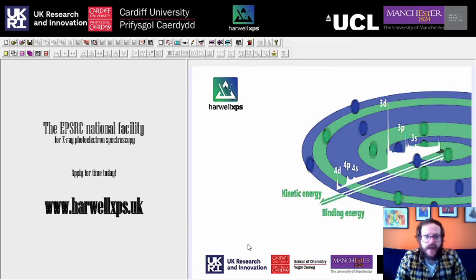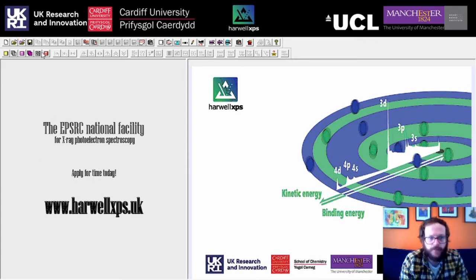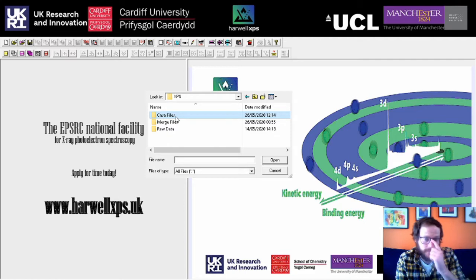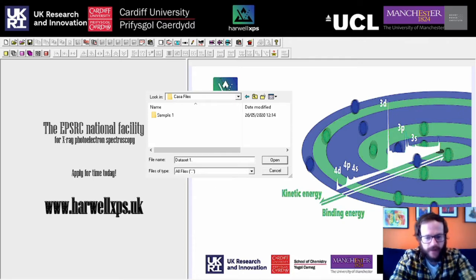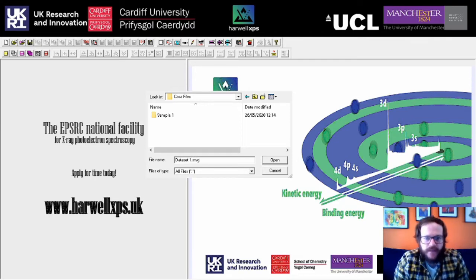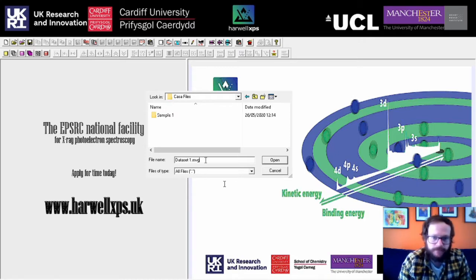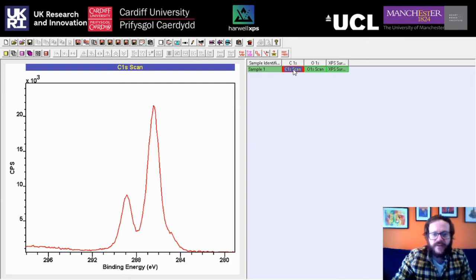Now that we've converted our Avantage dataspace files into .avg format, we just need to do the last conversion. Head into the CASA software and go to File — instead of Open, use the Convert option. Find the root of your output folder — the CASA files folder — and create a new file called something like 'dataset1', making sure to use the extension .mvg. This will import all of the samples and title the data based on the folder names. We've got one sample here called 'sample1' because that was what our folder was called, and all of our data is there.